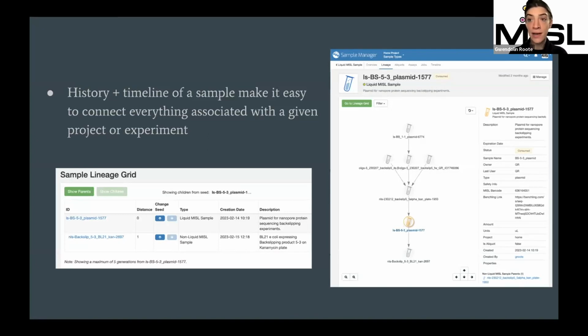It helps to find out, like, oh, if all of these ones at the bottom of this tree have an issue, maybe we can isolate one step of this chain that caused it. And that's not really a simple thing when you don't have these kind of lineage trees, right? You have to rely on reading through text that might have been made by multiple people, perhaps some undergraduates who haven't been fully trained on data storage. So this makes that whole process very straightforward.